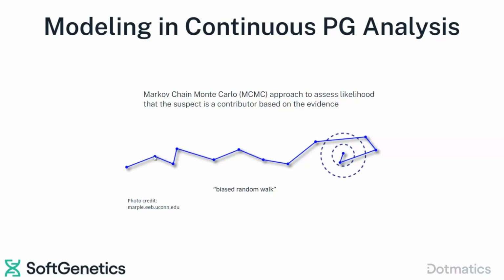Is it closer to the actual that's in the sample? Then go to the next set and so on. This repeats over several iterations until it comes to a convergence and has weighted the most likely genotype combinations that would explain the data.